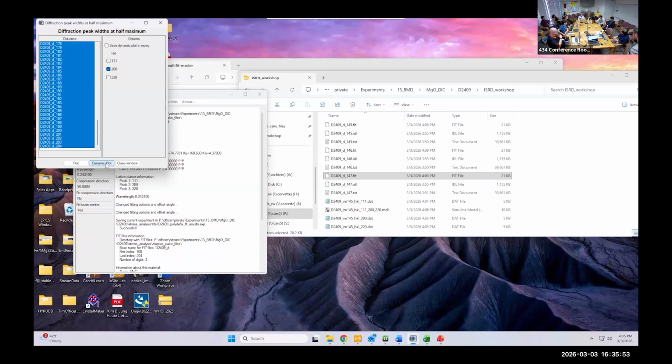Okay, how long does it take? It'll probably take about 15 minutes to open the press. It's at pressure right now. You could do something else and then come down there. Maybe we could do the setup here first. And after dinner, we walk over there and you take the cell out and then we call it a day.